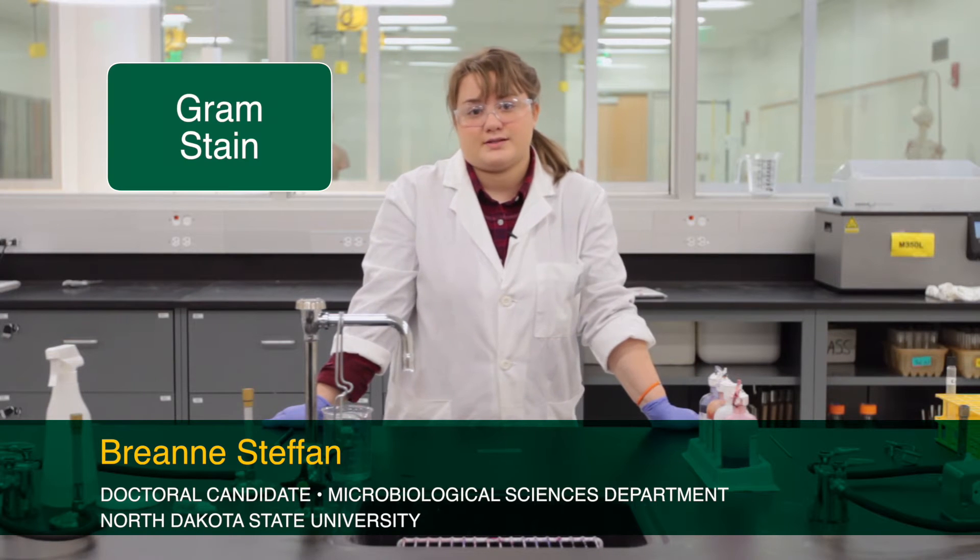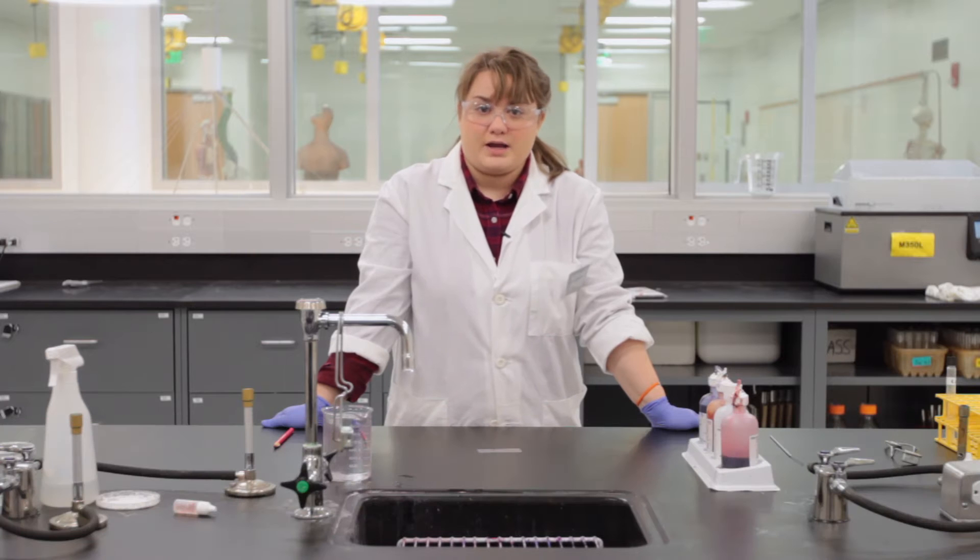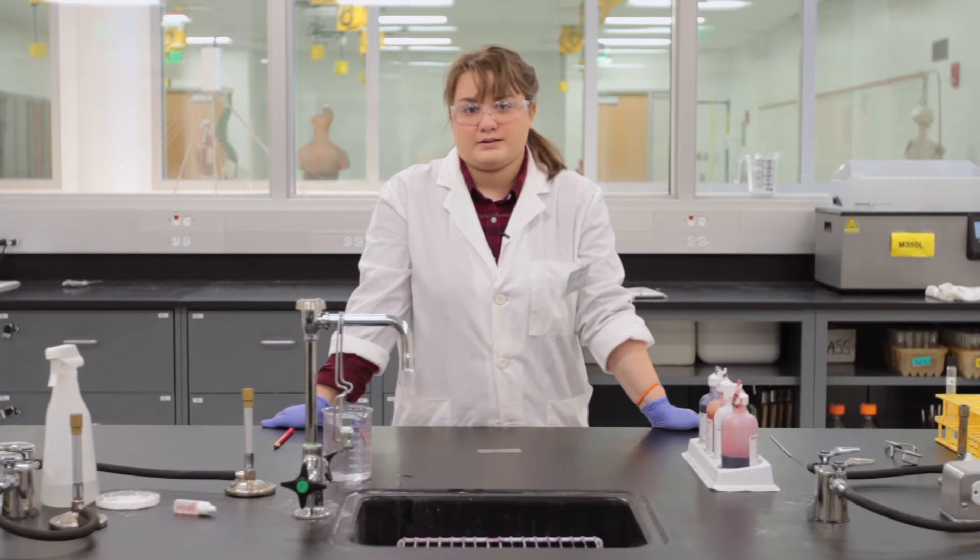Hello everyone! Today we are going to be doing the Gram stain, which is a differential stain that tells us whether or not we have gram-negative or gram-positive bacteria, and this is based off of their cell wall.